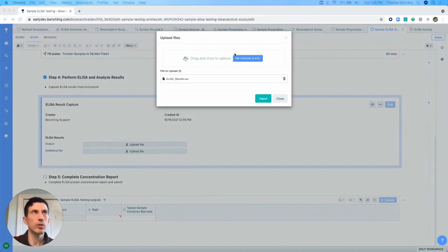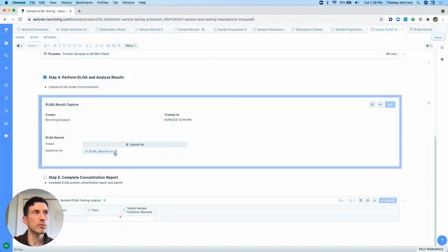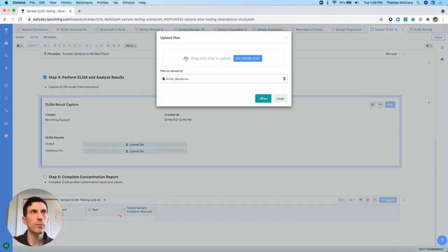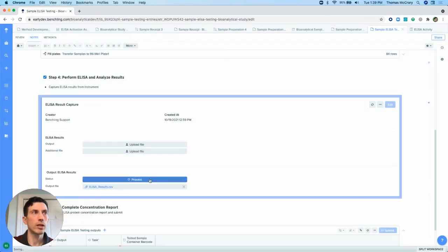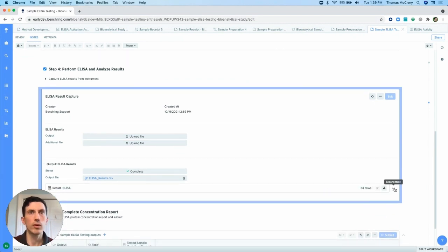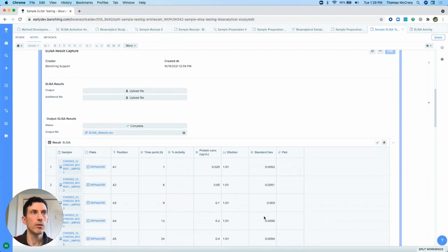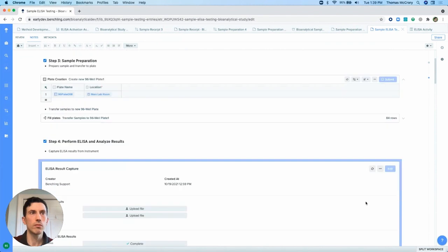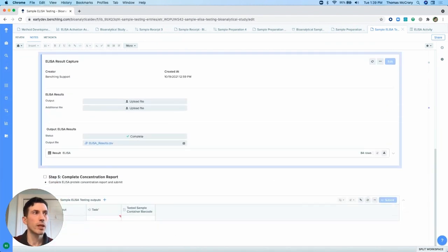So in that sense, we're going to just drop them in, but she'll drop in her lab automation, drop those into her run here, and then let Benchling do the rest. So she'll be processing that and capturing and automatically assigning those results directly to the samples that were on the plate readout. So here, see here, we've captured all of this rich information straight from the plate reader. All right. And then lastly, just similarly, she'll complete the output.